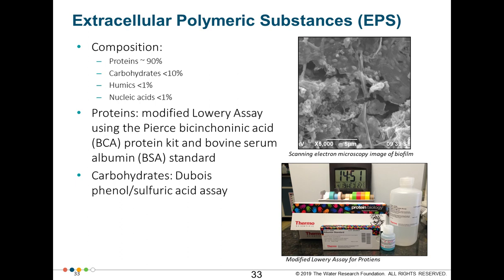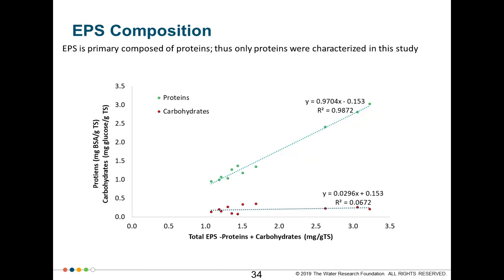And it's based off research conducted at the University of Texas by Dr. Keithley and Dr. Kiersitz, where they evaluated 6 extraction methods for EPS. During their study, they also found that proteins were the dominant fraction from about 11 full-scale biofilters where they sampled EPS concentrations.